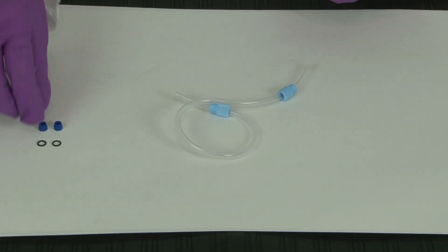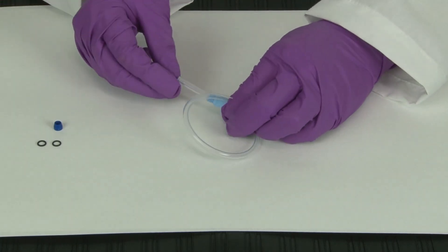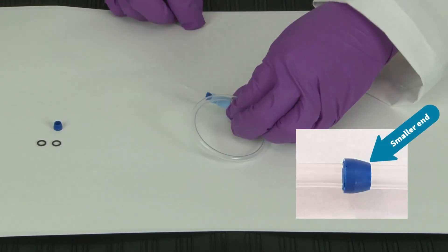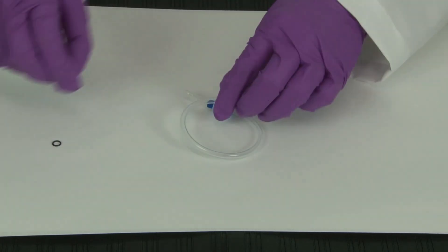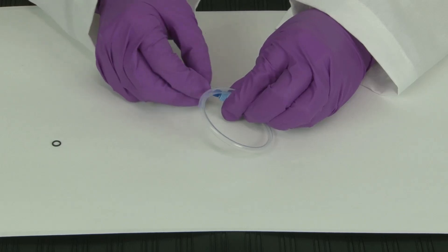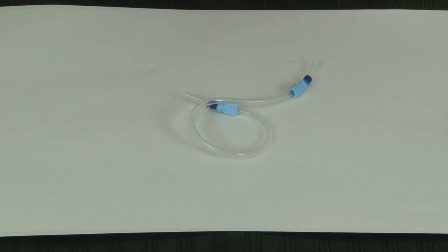After that, add the navy blue ferrules so that the smaller end points to the light blue nut. Now add the black o-ring to the end of the tubing. Repeat these steps on the other side of the tubing.